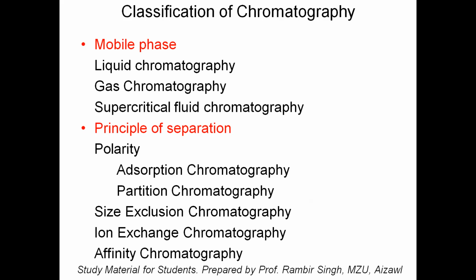Now the fourth principle was ion exchange. It was used for separation of molecules which are ionic, particularly proteins, because proteins are either anionic or cationic. Suppose I have a protein mixture, and my protein of interest is anionic in nature. Then I can easily separate this kind of protein from the rest of the proteins, because I do not require the rest.